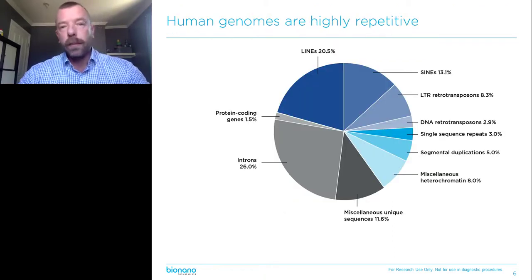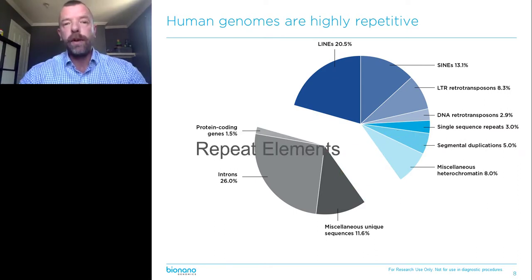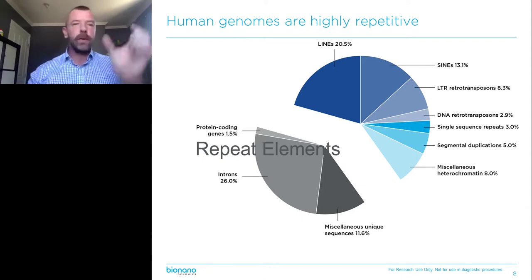And that is one of the complications with next generation sequencing. Also, the genome is just really highly repetitive. It's just about a third of the genome consisting of unique sequences and 2/3 consisting of repeats. And now, all but one of these repeats mentioned here on this slide, each unit on its own is already longer than the standard read length of, say, Illumina sequencing, longer than the 150 base pairs. So now imagine making sense of long tandem arrays of these repeats with only 100 or 150 base pairs at a time. It's just not possible.